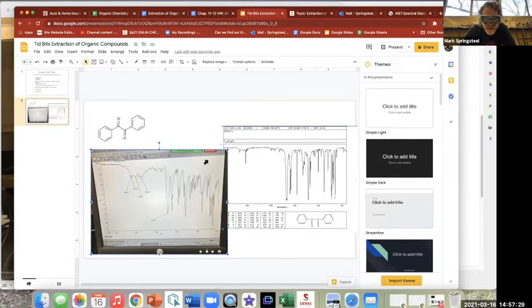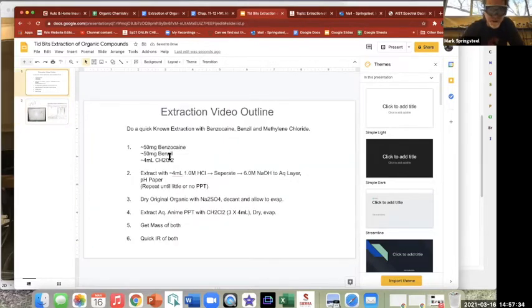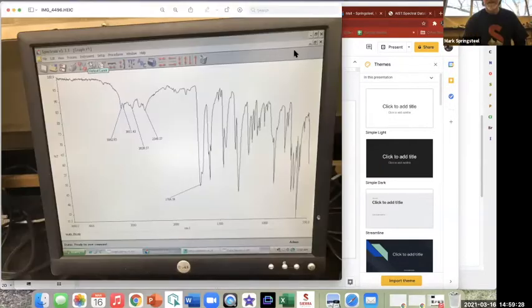So I'm wondering, should I do it or not? No, I don't want to do this. I'm going to switch up my procedure. I'm sorry, you guys. Or you know what? I'm just going to go grab the benzil. We have some in the stock room, so I'll be right back. Give me like 2 minutes. Sorry about this. Let me stop the share for a second.